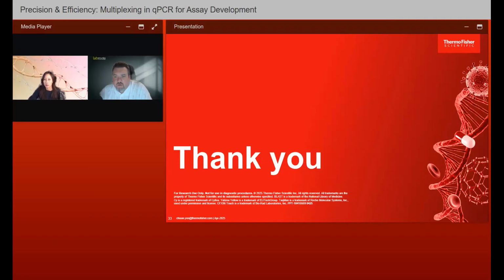All right. Thank you. Are primer and probe sequences provided for pre-designed assays? Unfortunately, that is not provided. If you want the sequence, you would have to go through the self-service assay design tool. All right.